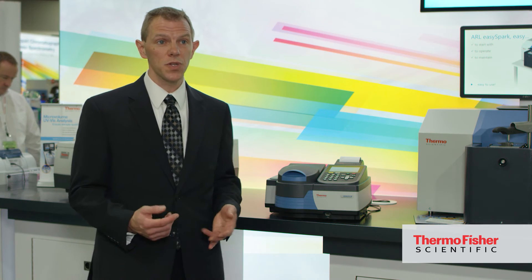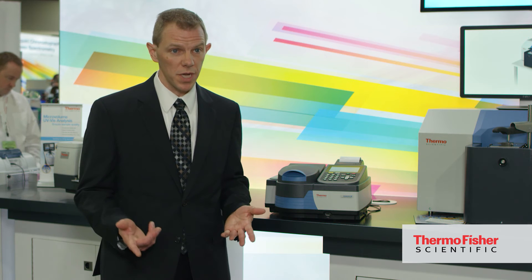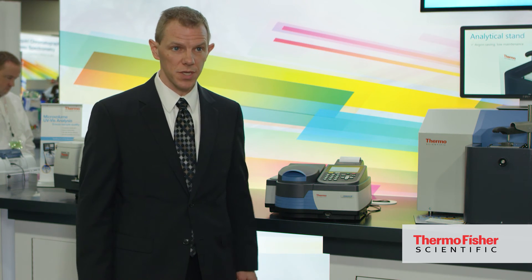Look for the Genesis 30 on FisherSci.com or at ThermoFisher.com — search for Genesis 30 on either site.